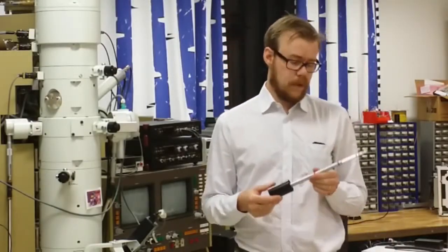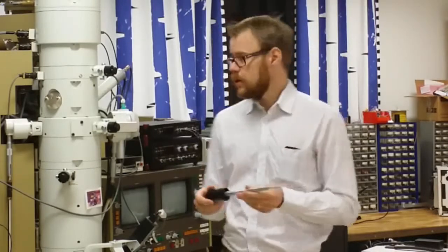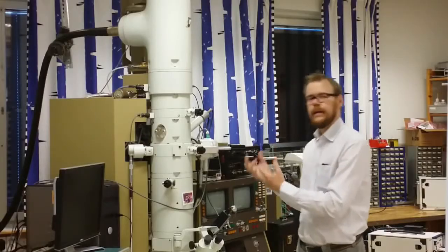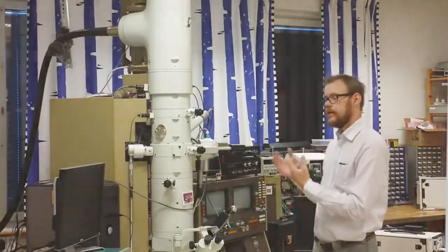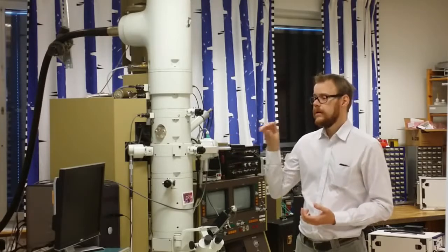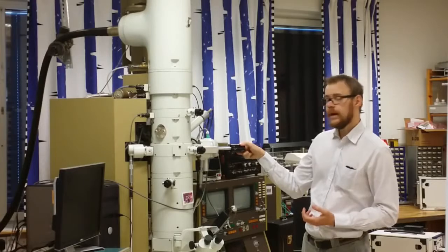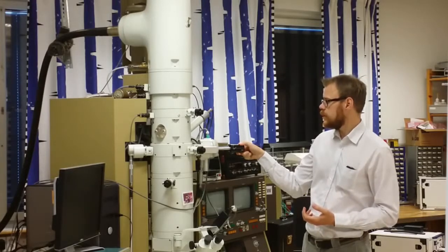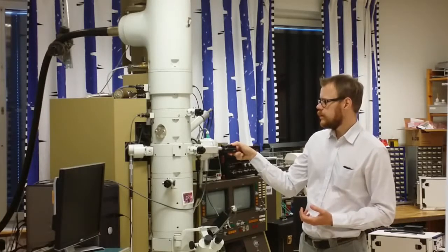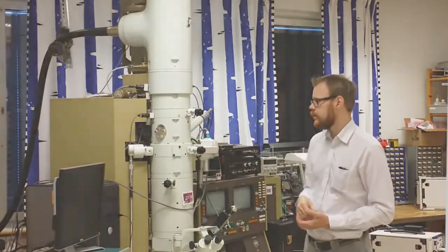So here I have the sample holder. The samples have already been mounted at the top here. We insert this sample holder in the side here at the midsection of the column. The vacuum will start to pump, and this usually takes a few minutes. So now when the air has been evacuated in this pre-chamber, we can rotate the sample and gently insert it inside the microscope. Be careful though that you continually hold and grab the holder while you insert it. Otherwise it might go too fast inside and actually hit something and destroy it.